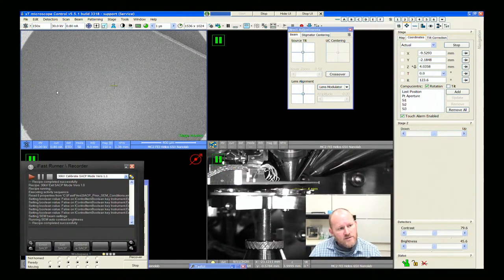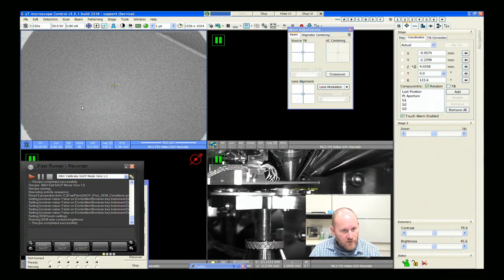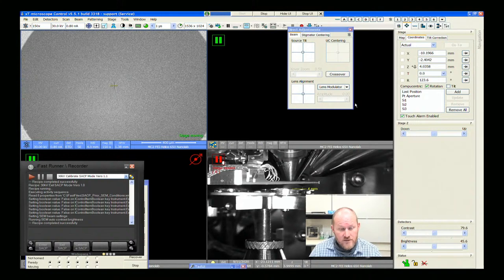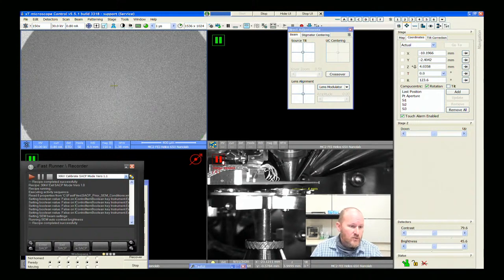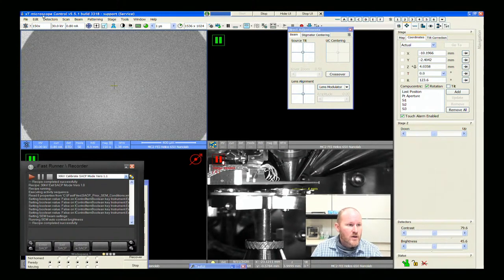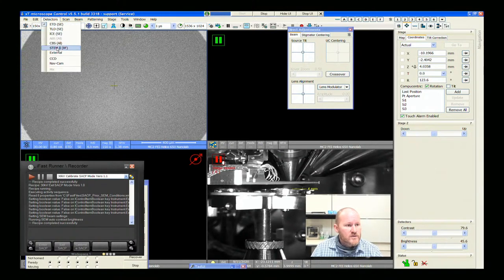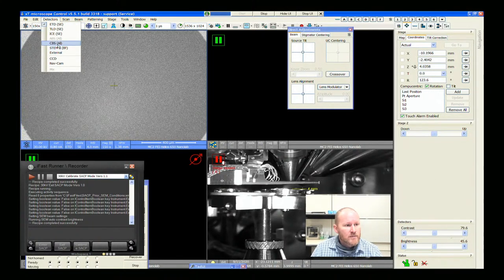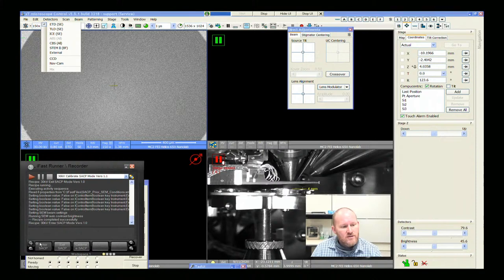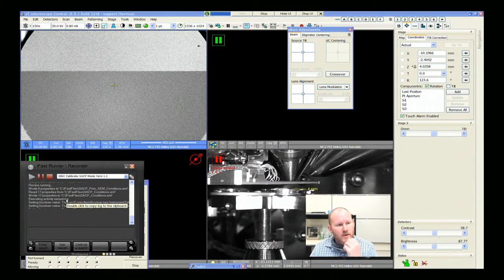So let's see what this wafer looks like — I should be able to go to CBS mode and just enter SACP mode.